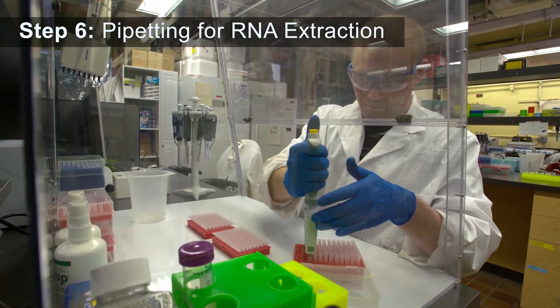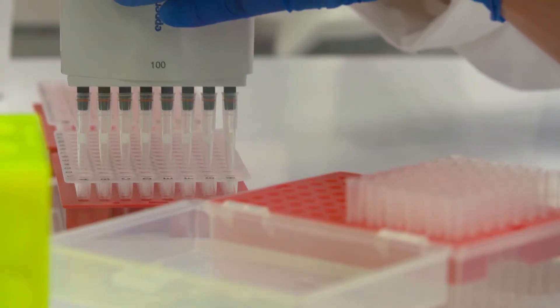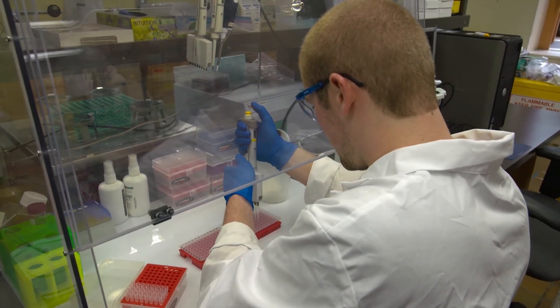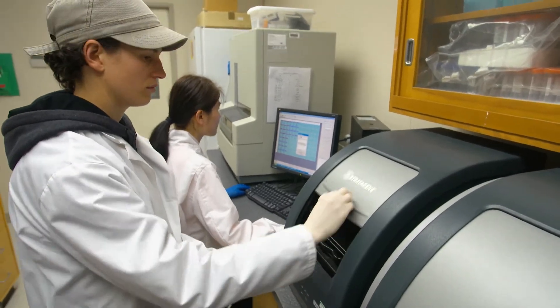Using a multi-channel pipetter can help speed things up, delivering multiple samples at one time. Using a 96-well plate allows several tests to be run at the same time. In this lab, molecular tests called RT qPCR are being run.